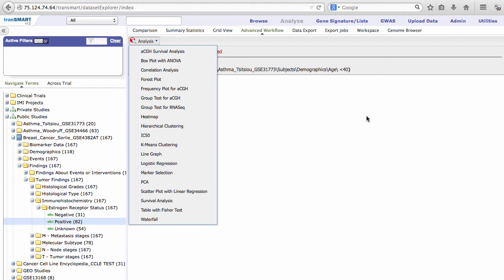Finally, you can explore the new genome browser within Analyze.